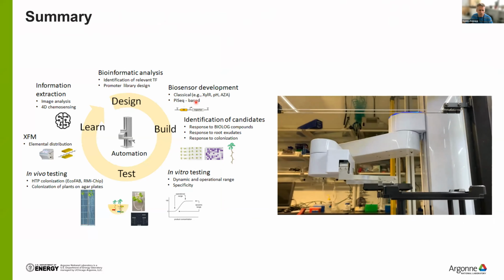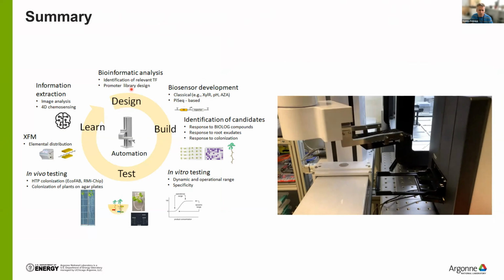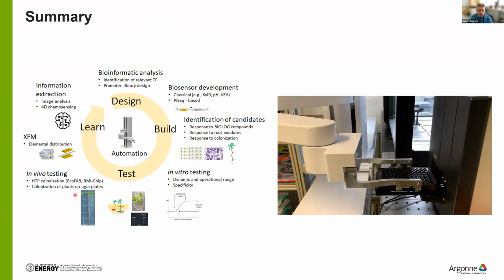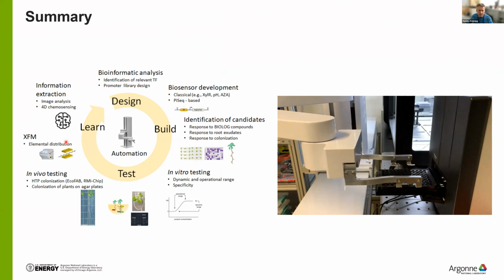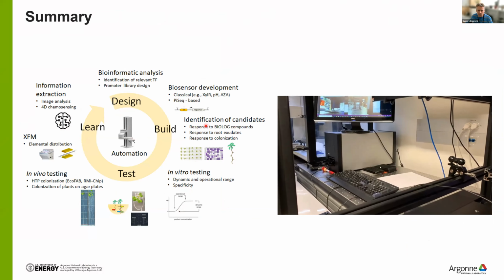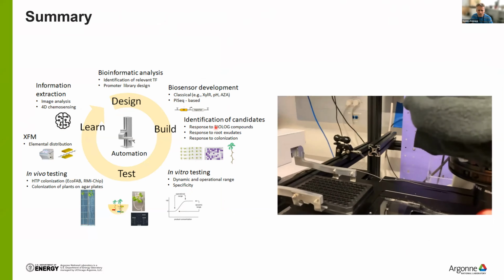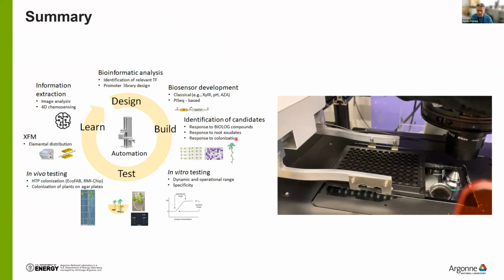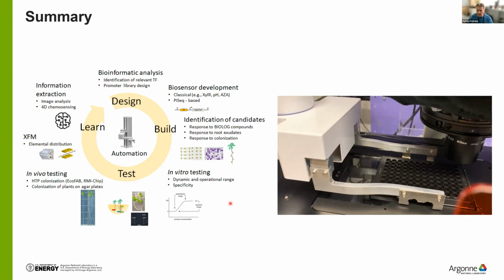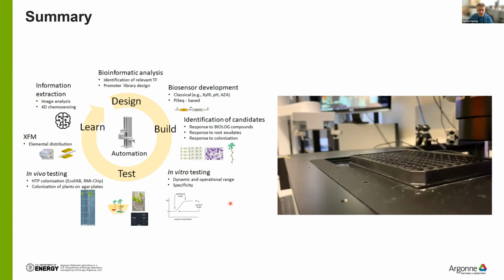This is my last slide. We are using a DBTL type of workflow to identify some of these sensor cells, performing the tests, also bringing in APS capabilities, AI, and then refining this until we identify some really high-performing sensitive sensor cells. We are also doing some automation, combining liquid handling and microscopy here in sector 84.